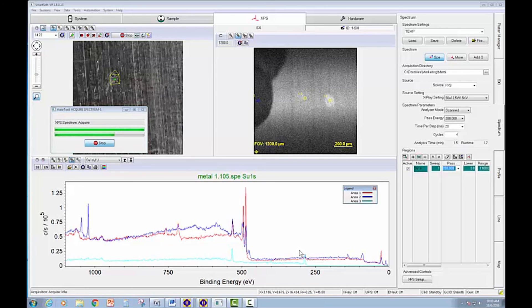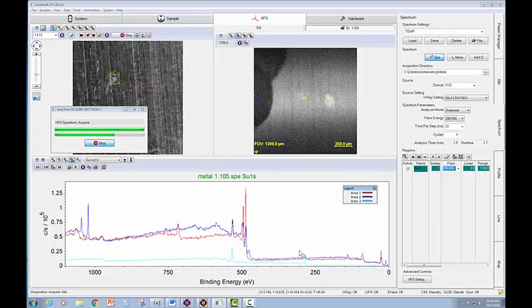So you can see very quickly, we can put in essentially an unknown sample that we think might have some localized features, find them, and identify them using multipoint spectra.